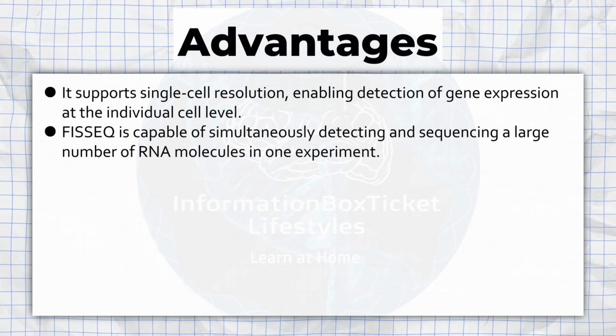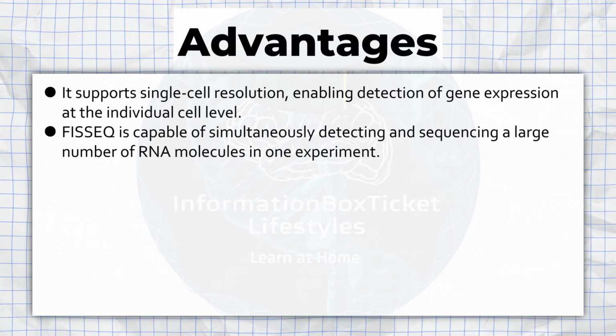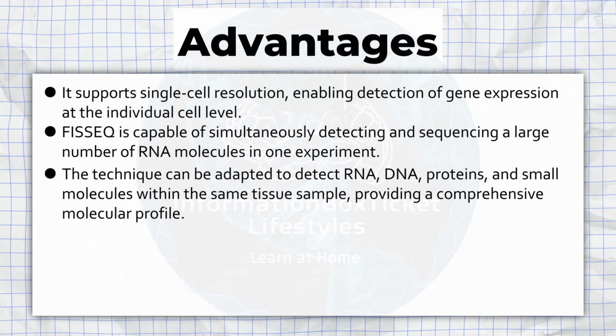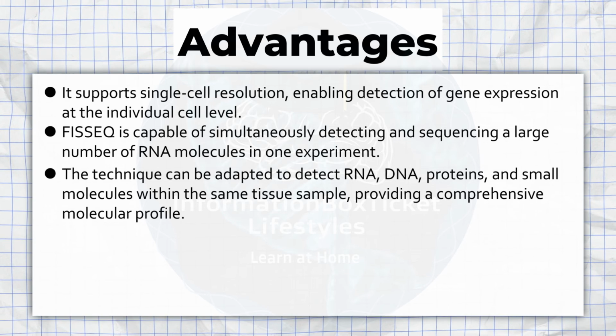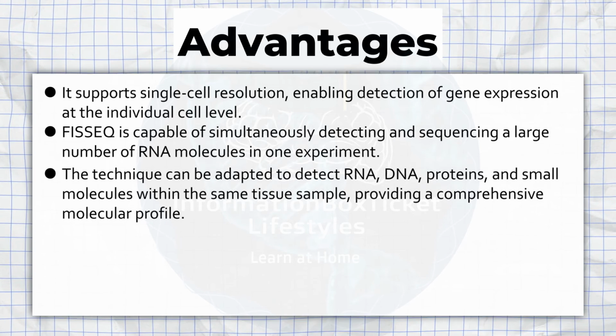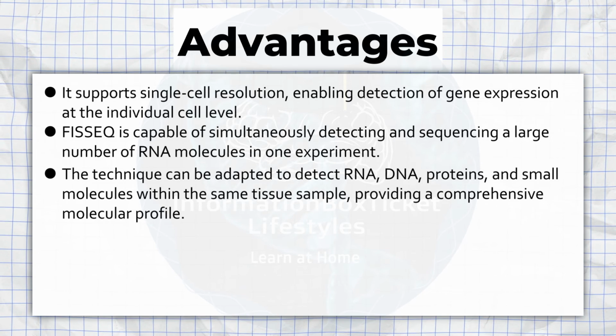Fluorescent in situ sequencing is capable of simultaneously detecting and sequencing a large number of RNA molecules in one experiment. The technique can be adapted to detect RNA, DNA, proteins, and small molecules within the same tissue sample, providing a comprehensive molecular profile.